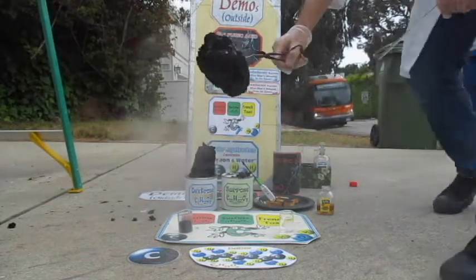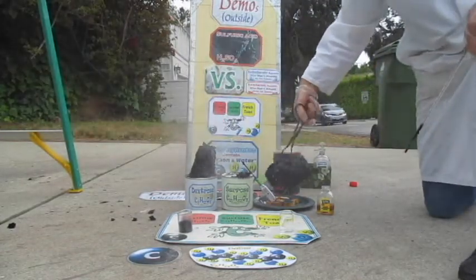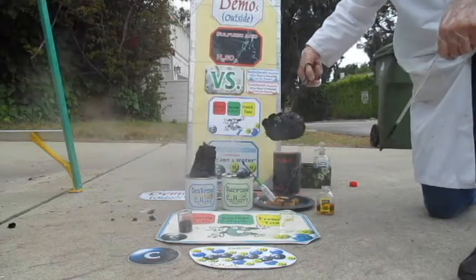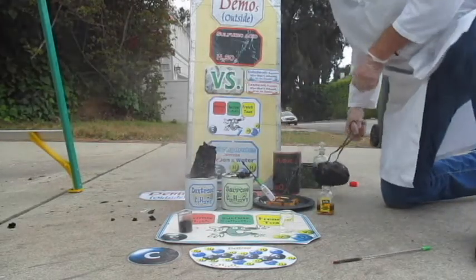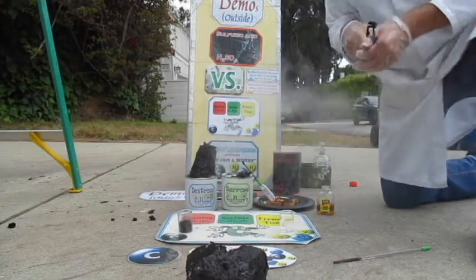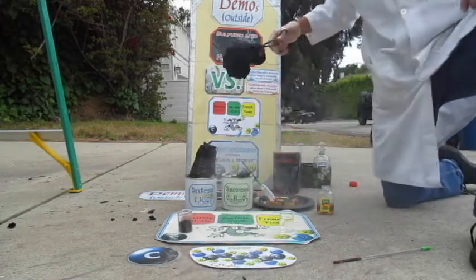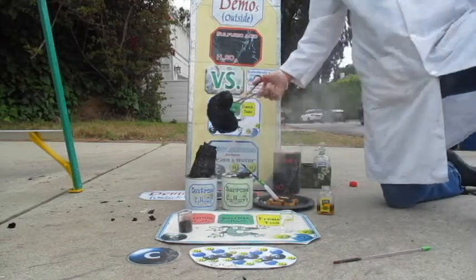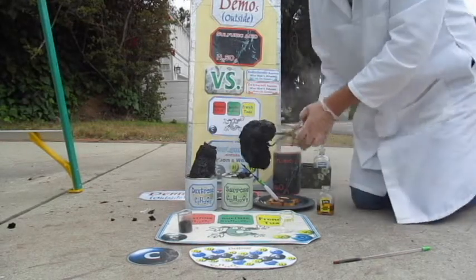It's a chunk of the carbon. This carbon was in that carbohydrate. All of this came out of that can of sugar, okay? So now, notice this one, it says on the digital thermometer, 136. That's a pretty good measurement. This one fell out. 137, it's still going up. This one unfortunately fell out.